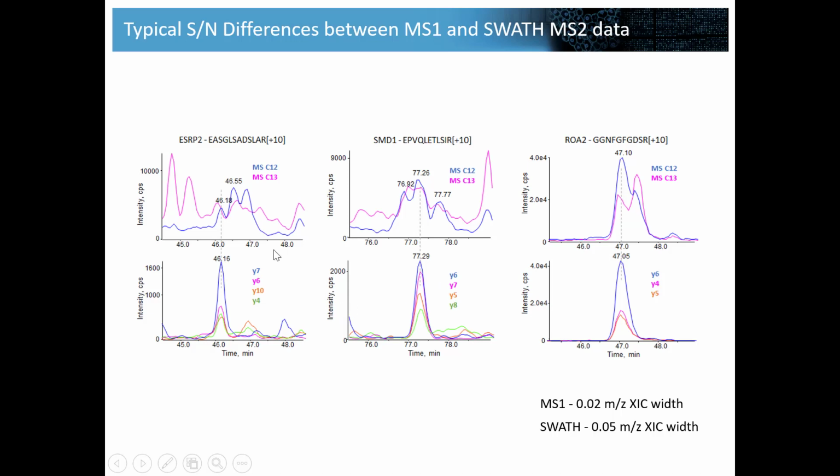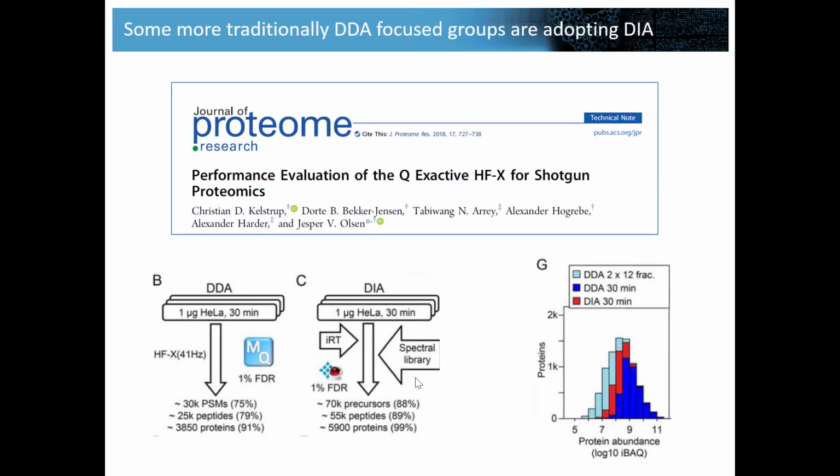and it will be interesting to see whether the quality of the MS1 data can be improved with newer methods and newer instrumentation that we can really fully leverage that. You can see this for yourself tomorrow in the tutorial data.